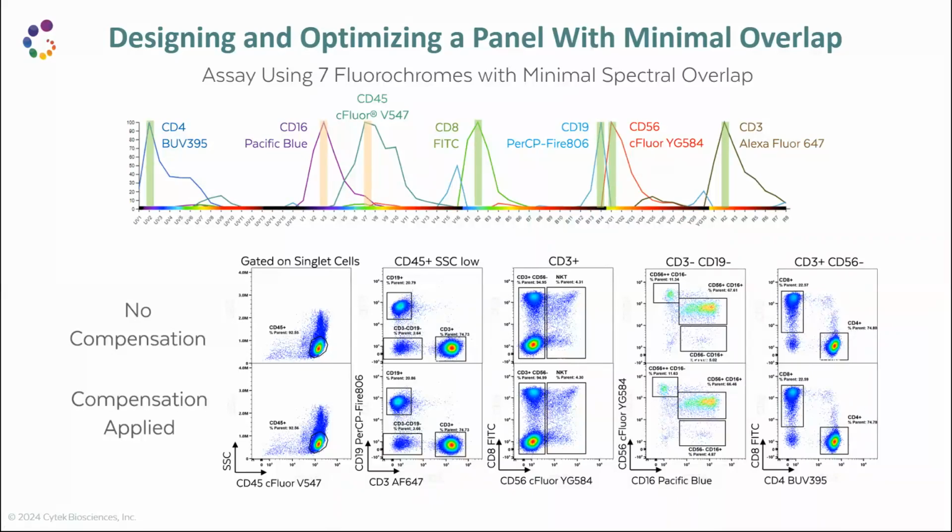So it's another way to go in terms of conventional when your assay is so simple that we have proven compensation controls are not needed. And of course, if you change specificities, if you change the fluors, you might go through the validation process, but it's definitely doable.